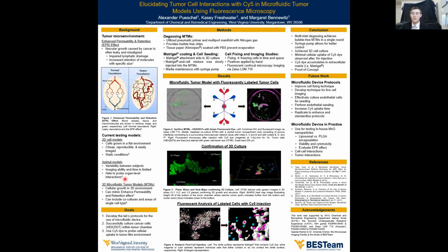Next, we'd like to increase the amount of time for uptake of Cy5, which will allow us to see if more time was needed to allow for uptake. And then we want to standardize the protocols so that we get the same results every time, and also they help us enhance the protocols.